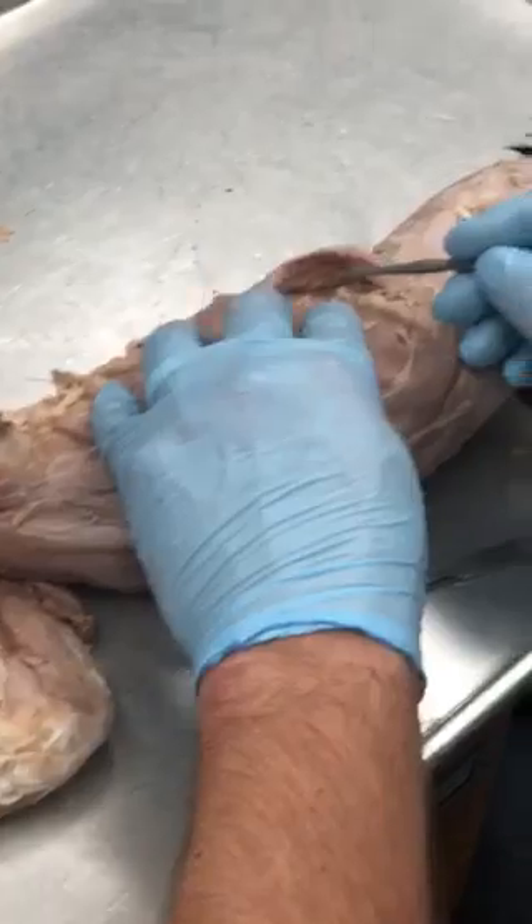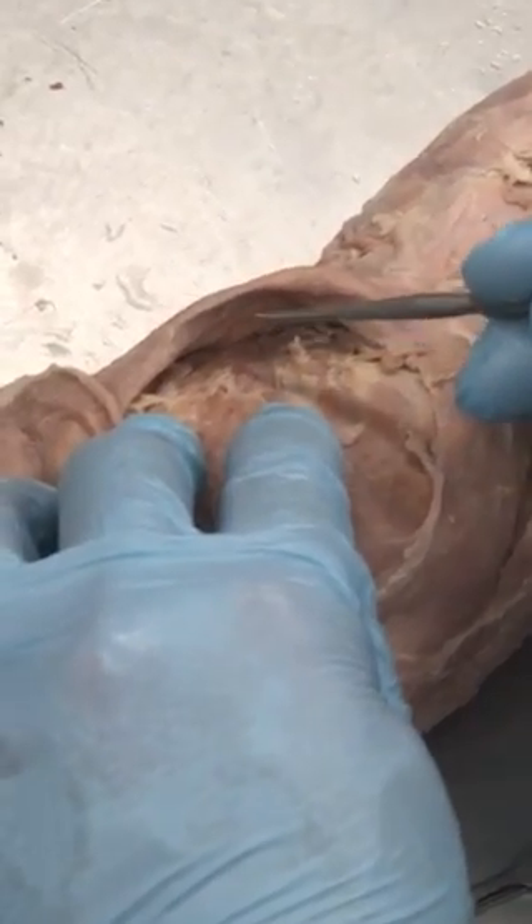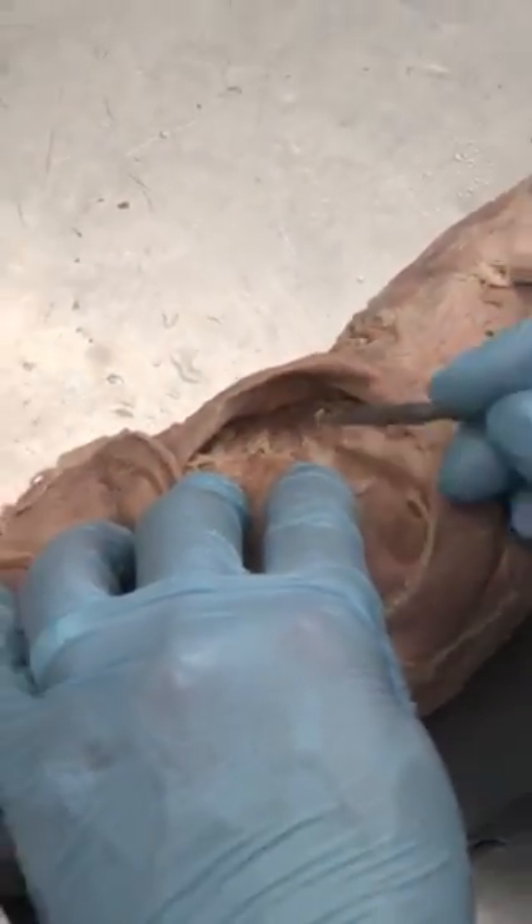And over here on the side, these guys right here, they kind of fall along with the rib cage here — that's the serratus ventralis.